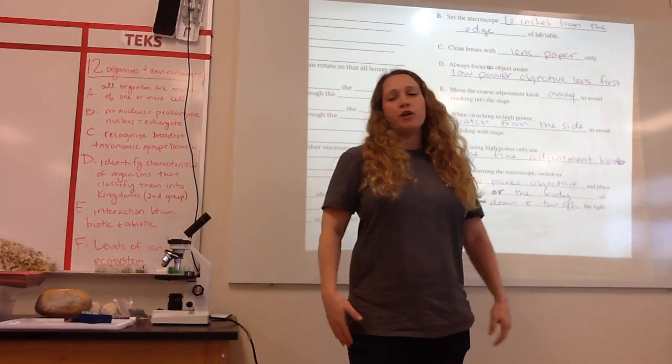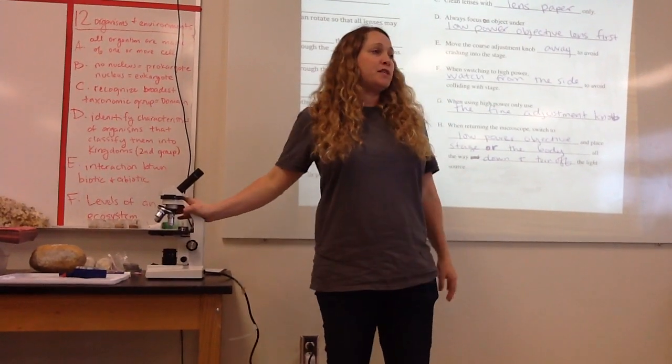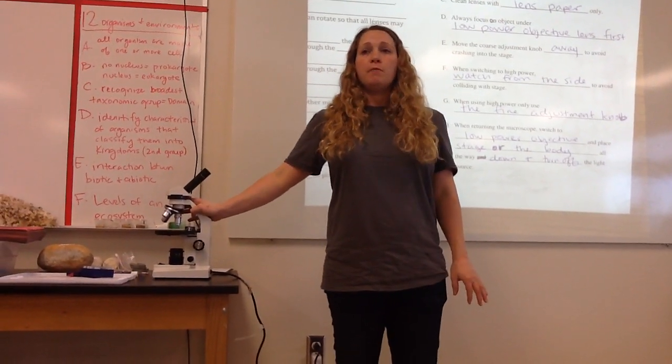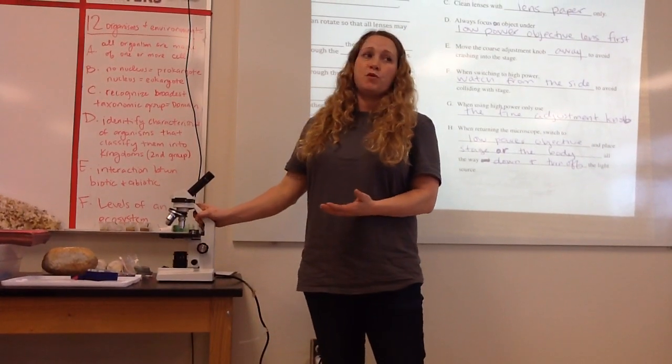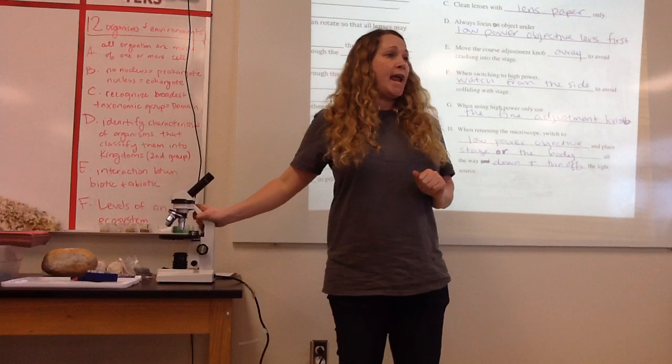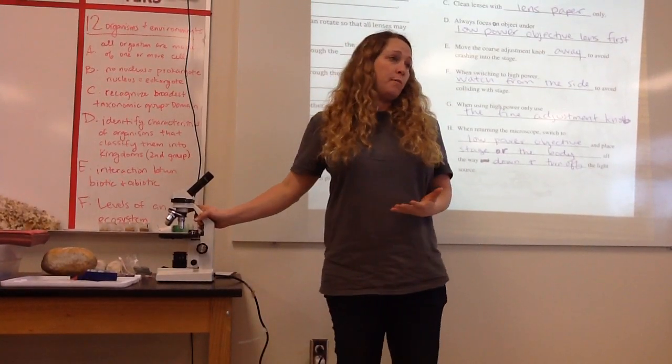All right, students, today we're going to learn how to use the microscope. It's very important because the microscope is an expensive piece of equipment. Very soon, on Monday, you're going to have a microscope quiz, and in order to use this very expensive piece of equipment, you're going to have to pass the quiz with an 80. So it's very important for you to learn this, and also it's important to take care of the equipment, okay?